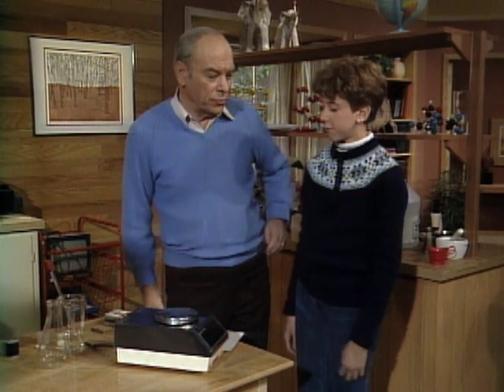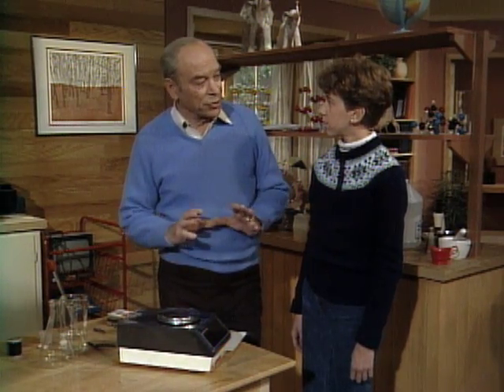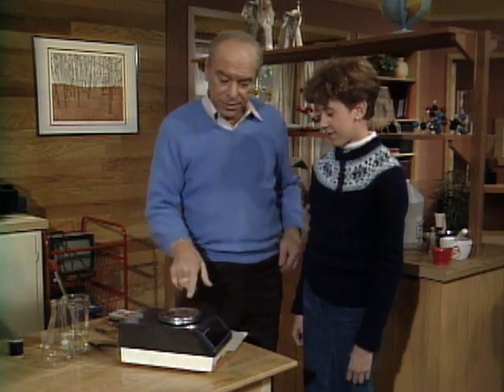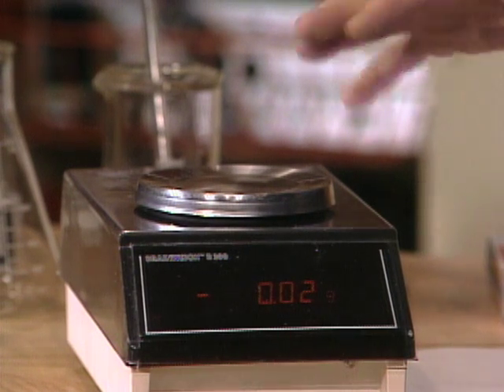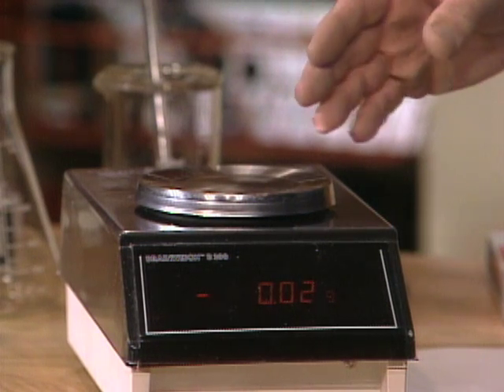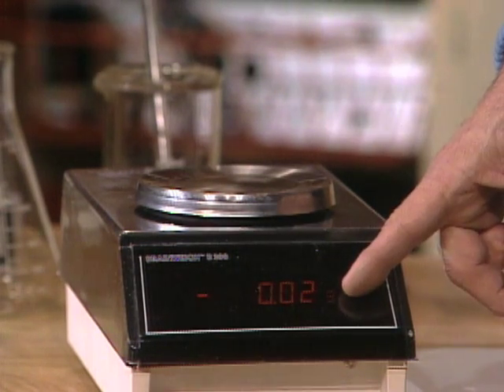Stacey, I don't assume you've had a chance to work with an analytical balance or a chemical balance. No, I haven't. Well, they're a real challenge because you have to watch almost everything because they're so sensitive. Now, ordinarily you've seen them with two pans, but here's the same idea — this one is electronic in that it dampens out very quickly so it doesn't vibrate back and forth, and you can get the reading right here.